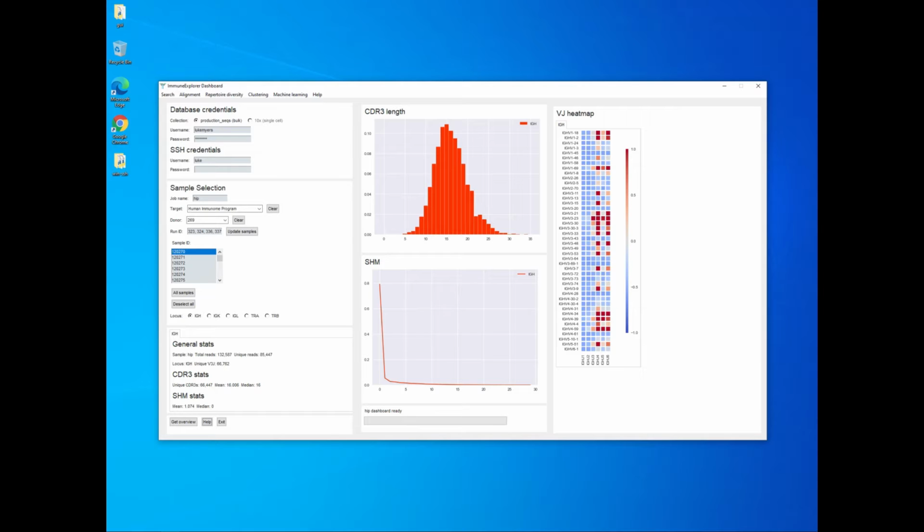just so that we are all populated and we're not sitting around waiting and watching it together when instead we can be talking about what we're looking at. So the first thing that you do to get started is, of course, to enter your database credentials. Once you have permission from Jim or Rob, you can go ahead and ask TechCore for Mongo and shell access on some of these larger departmental resources. And for the database job, you just need to enter your username and password for the database section.